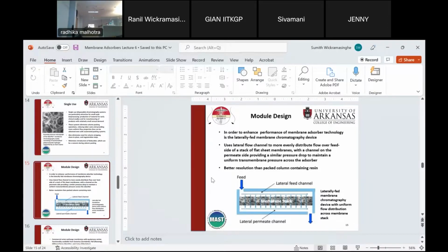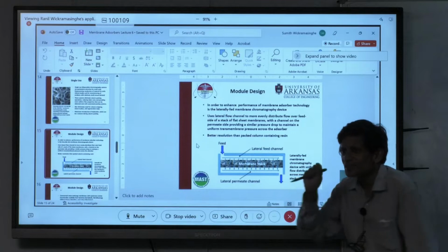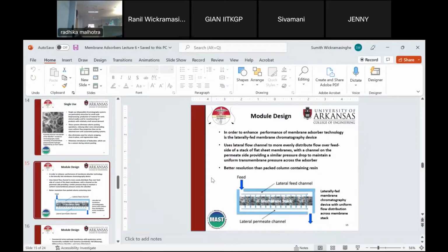Yes. Now, the reality is if it's slightly slanted, it really depends on what is the pressure, the relative pressure drop through here to this. If it's a small difference, it doesn't matter. But if it's large compared to the overall pressure drop, it's a problem. But yes, yes. But this is still much easier than packing a column. Okay, but yeah, you're right.